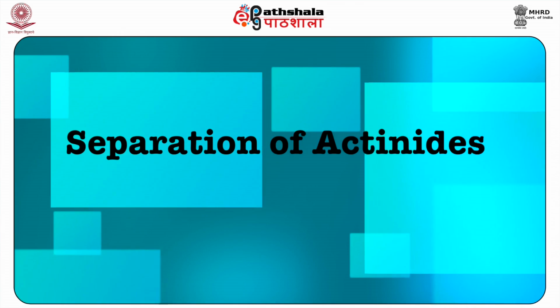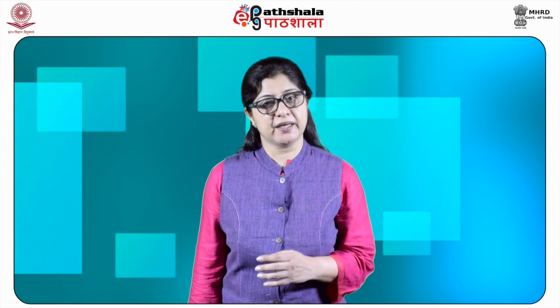Separation of actinides. The ion exchange chromatographic technique has played a unique role in the discovery of trans-plutonium elements in actinide series. In the actinide series, the elution occurs in the reverse order of the atomic number due to the actinide contraction, and this proved to be the only way for identifying these elements. Some of them having been produced only in the atom quantities. It may be said that their isolation would have been impossible by any other separation method.